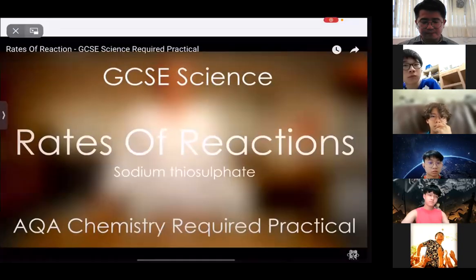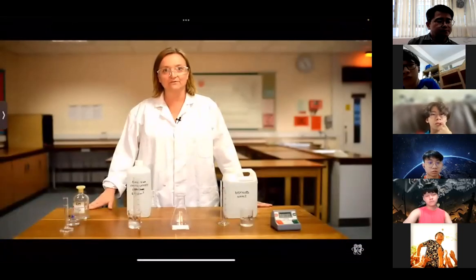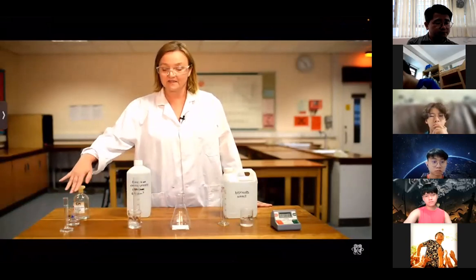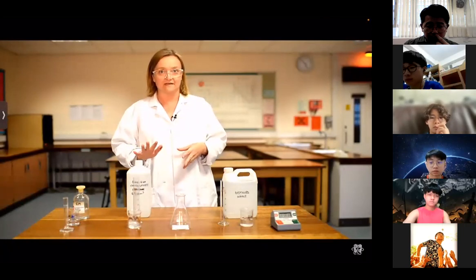This is the first of 2 videos in which we're going to be looking at how we can measure the rate of a chemical reaction. In this video, we're going to be looking at the reaction between sodium thiosulfate and hydrochloric acid. When the 2 solutions react together, they produce an insoluble precipitate of sulfur. As that's made, the solution will go from being clear and colourless to a kind of yellow, cloudy colour.